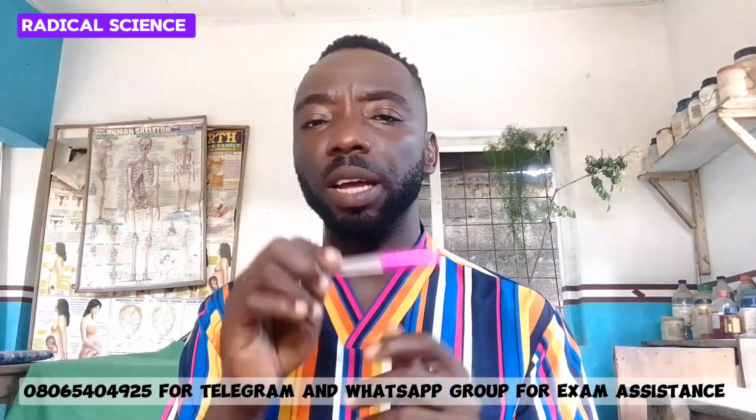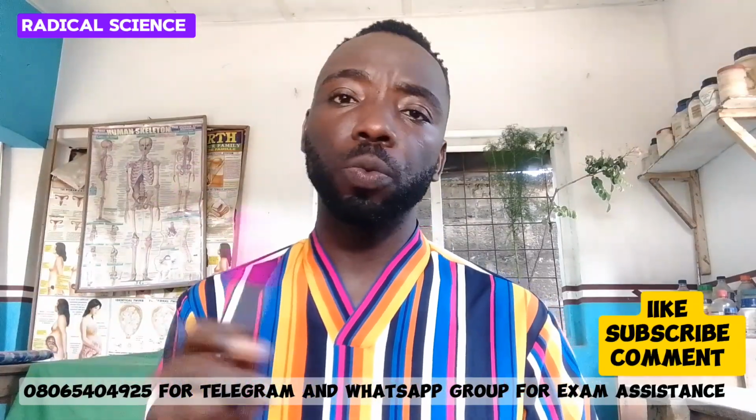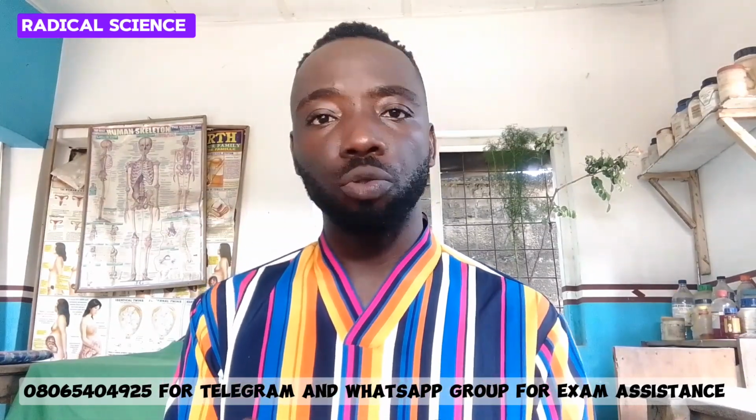If you are among the GCE students writing chemistry practical this year, all I want you to do is just to pay attention to this video, because I'm going to show you everything you need to know as far as the GCE chemistry practical and their specimen is concerned. Remember, do not skip this video, because whenever you skip my video, you miss one step or the other, and by the time you try to carry out your own practical, you may have a failed result.